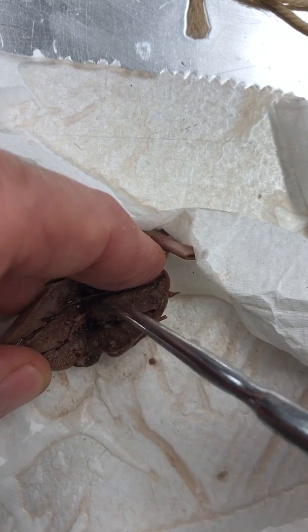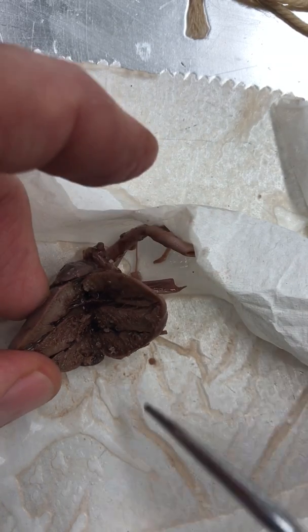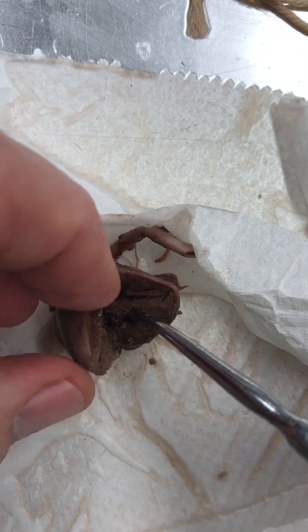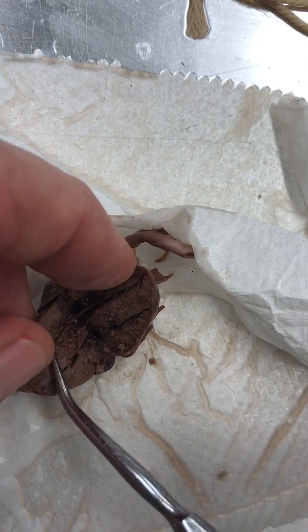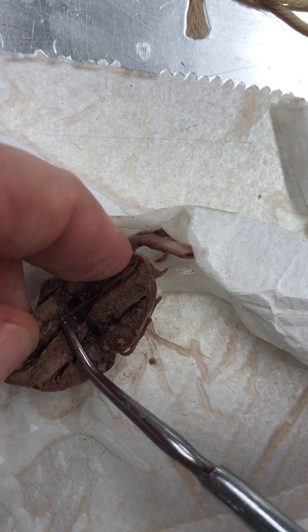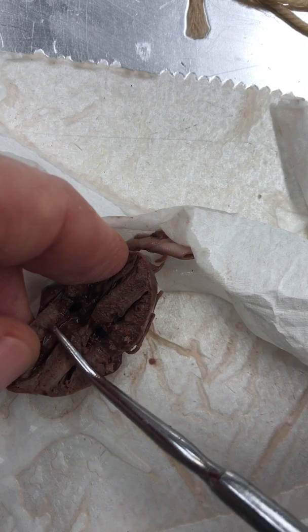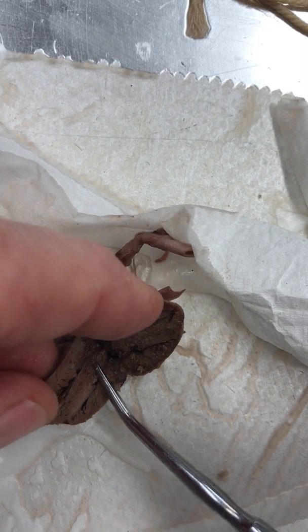You've probably heard of people who've had valve replacements. So we have valves that connect the various chambers of the heart that keep blood flowing in one direction. Sorry. This one's actually in pretty good shape. We have these little strings. You can see that maybe. That's called a chordae tendineae. It's like a parachute cord. Oops, sorry, just ruined that for you. Okay, so that's the heart.